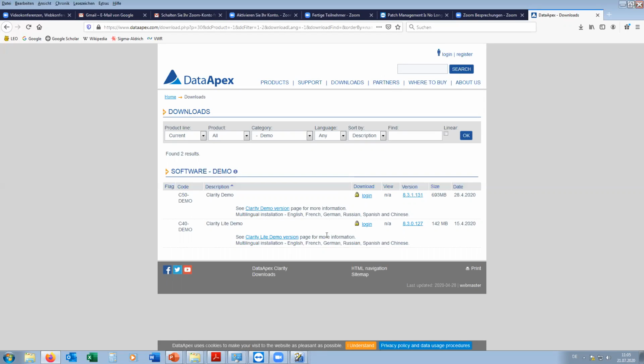So on your private PC, if you are on site and you have results and you want to take them home and work on the results at home, this demo version works.